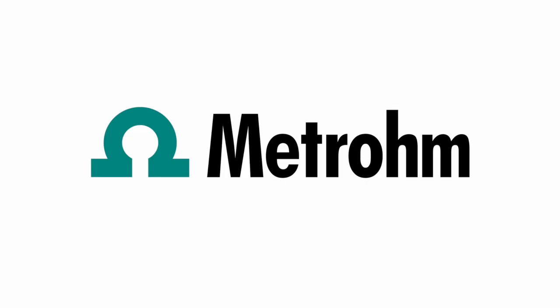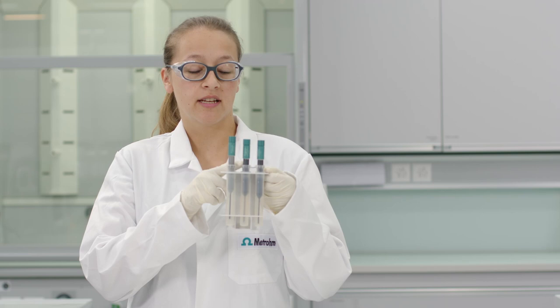Hi, I'm Mona. In this video I will show you how to handle the three different types of electrodes that you can use to perform aqueous surfactant titrations. The three different types are the ionic surfactant electrode, the cationic surfactant electrode, and the non-ionic surfactant electrode.